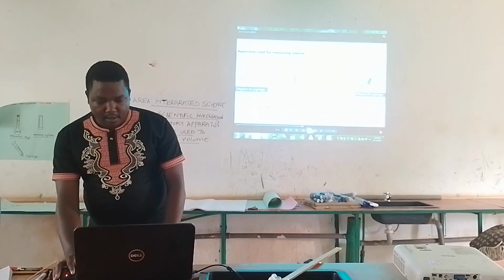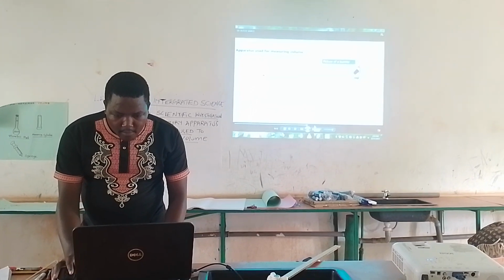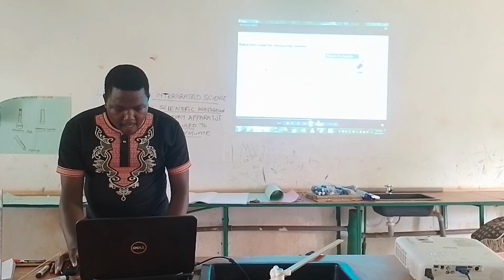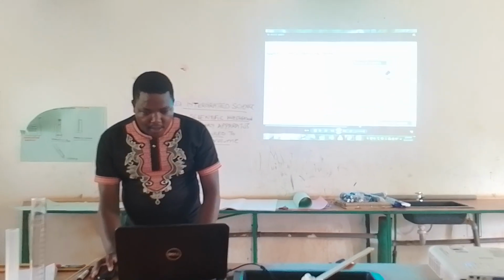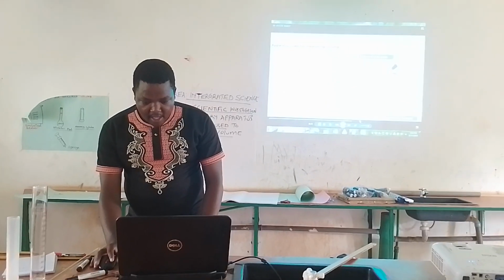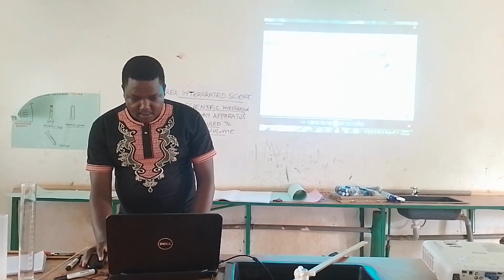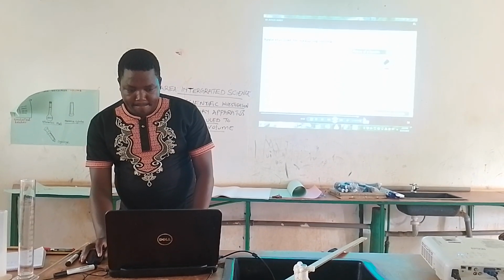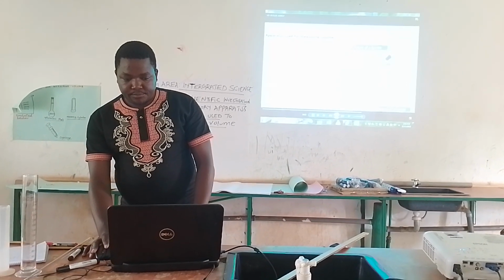So the video is very long. That is a pipette. Burette. That is a burette. It's a tap. No, that is a burette. We will interact with this apparatus and then you will understand them. That is a burette when it is working now.